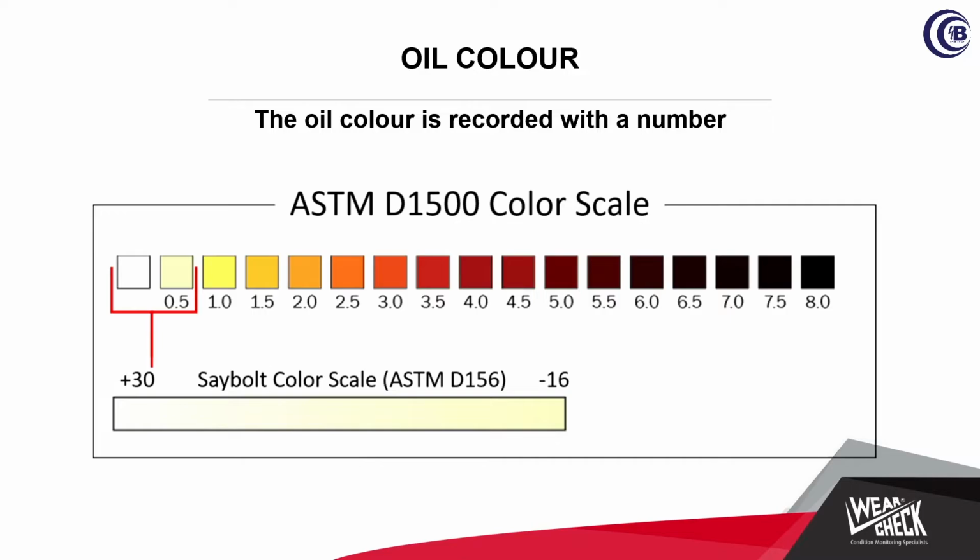We are busy standardizing on this color chart. We are using this already in our WSL, that's our Johannesburg laboratory. That's also our SANAS accredited laboratory. There we've got a specific instrument that gives out the value, ASTM method. Our two laboratories in Durban and Cape Town are still using the visual, where we will say it's a straw, light straw, amber type color.